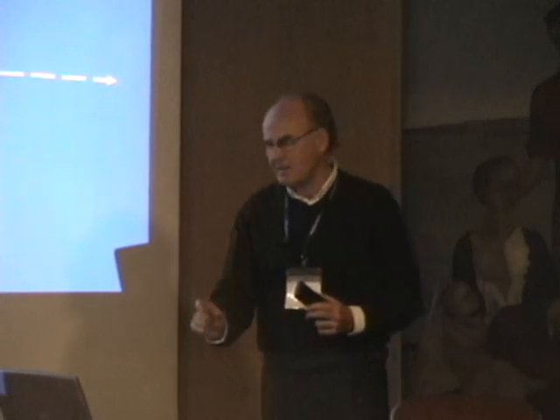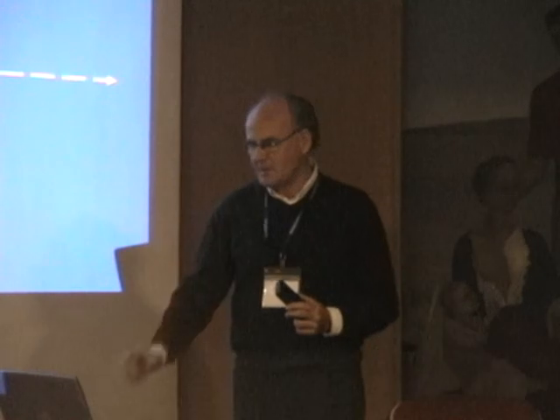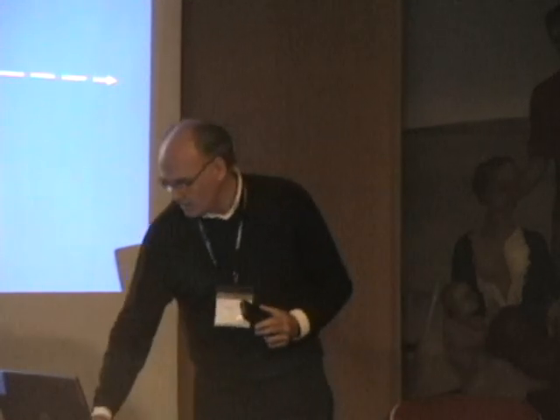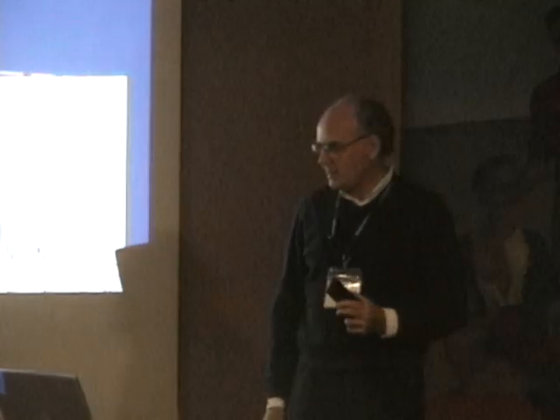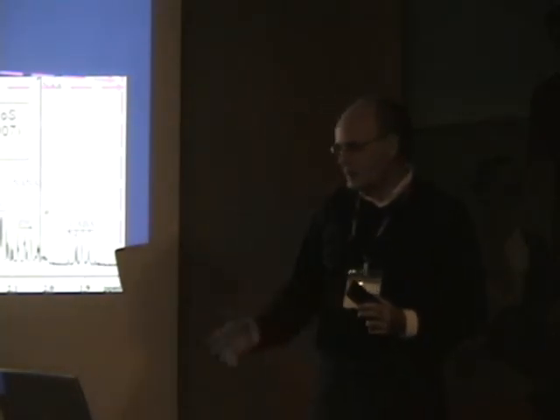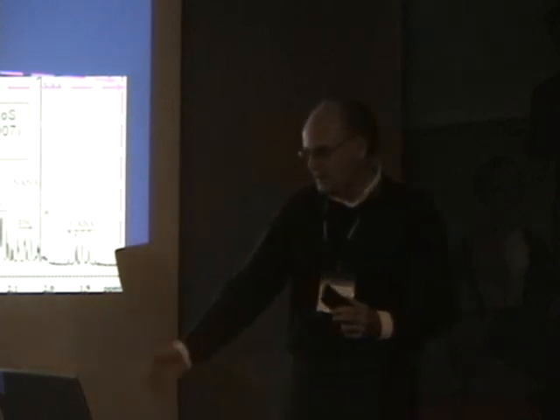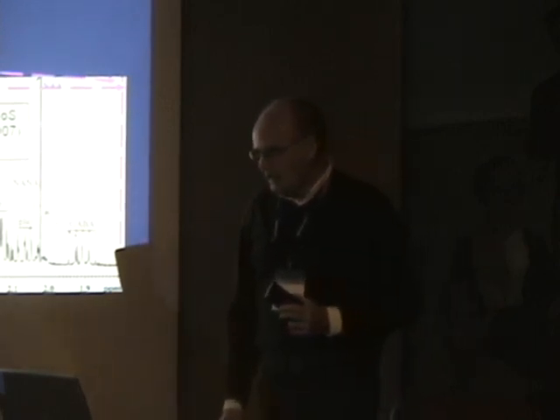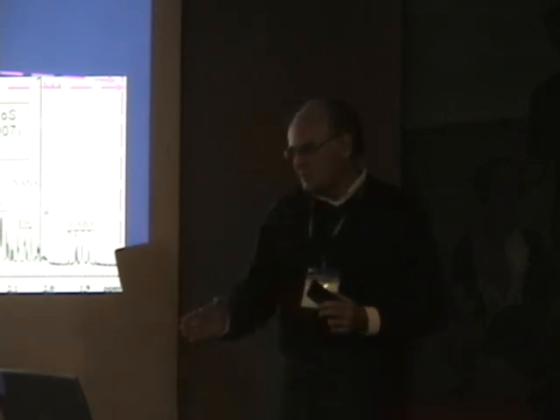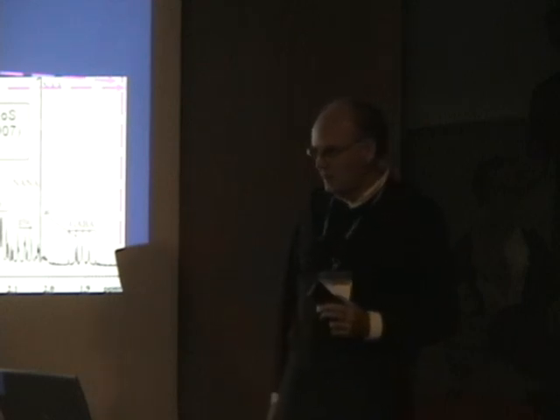If you look at exactly the same spectral region from a brain extract after having processed it, looking at the water-soluble metabolites, you get something like this. And this is exactly the same spectral region that is highlighted above. So you see there are a lot more peaks. If you count also the small peaks, it's over 90 peaks that you can distinguish here. And most of these peaks are extremely narrow. They're almost like vertical lines in this presentation.